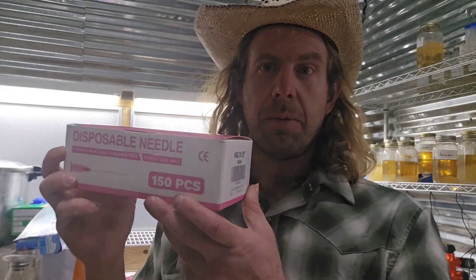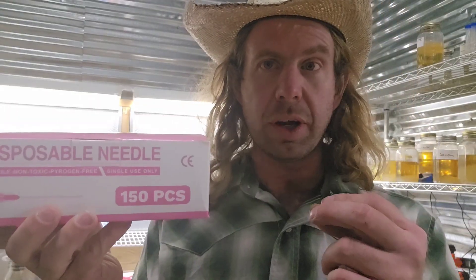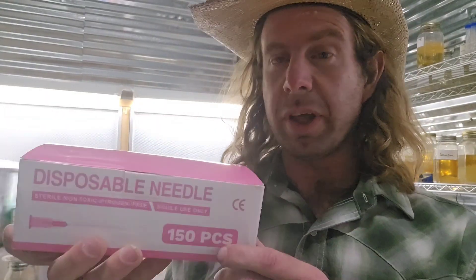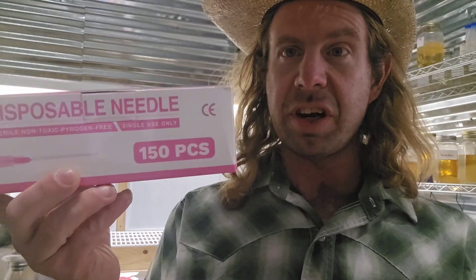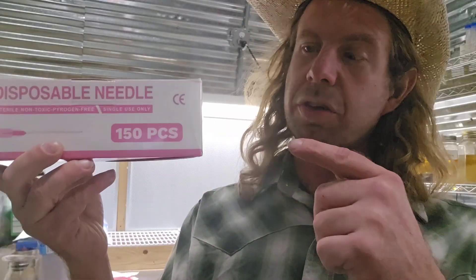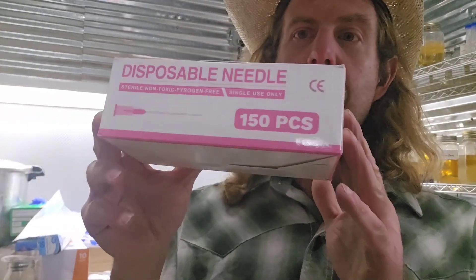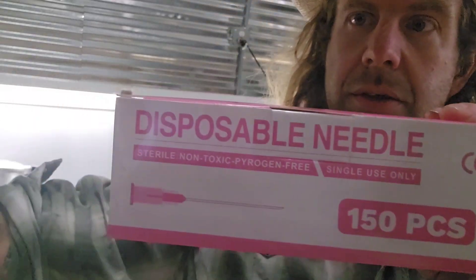Number thirty: sterile needles. You need these for all sorts of things on your mycology farm. I prefer a 16 gauge — that way you can do needle biopsies with a sterile needle. This also works great when you have really thick mycelium or really thick liquid culture. I make some really thick liquid cultures here on my farm so I like to use these 16 gauge needles. I include some sterile 16 gauge needles with every order of liquid culture on my website. Number thirty: sterile needles.